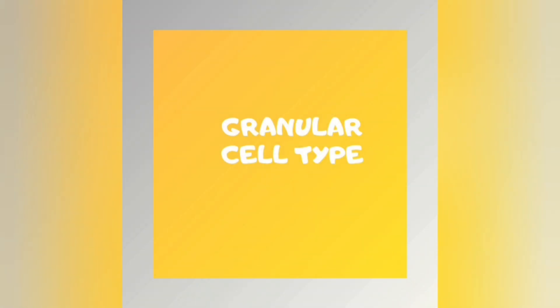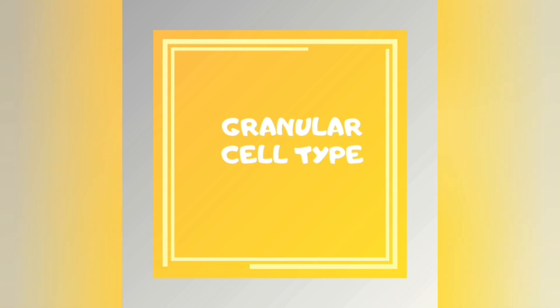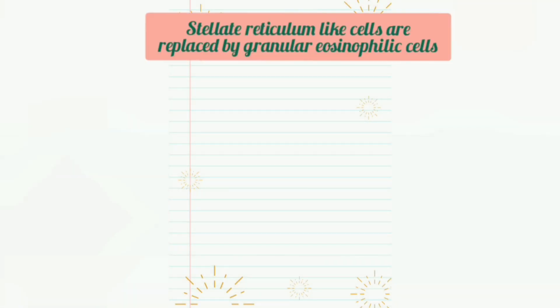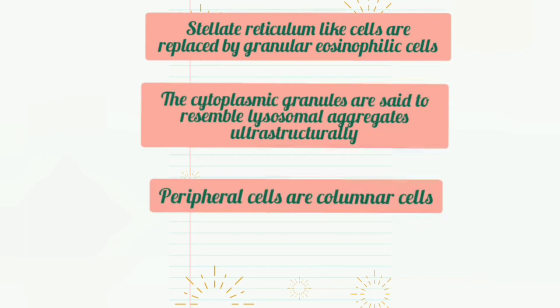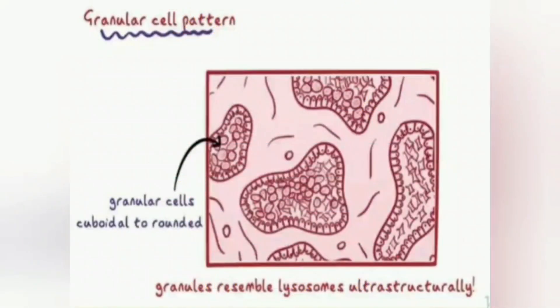Granular cell type of ameloblastoma: here the stellate reticulum-like cells are replaced by granular eosinophilic cells. These cells are said to resemble lysosomal aggregates ultrastructurally. The peripheral cells are lined by cuboidal or columnar cells, as shown in the figure.